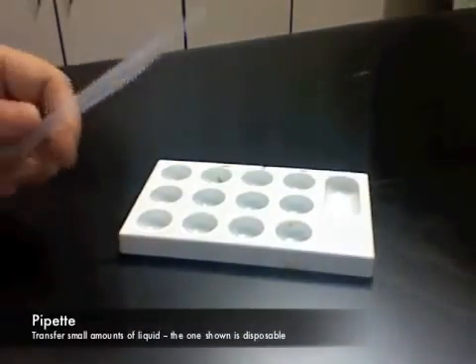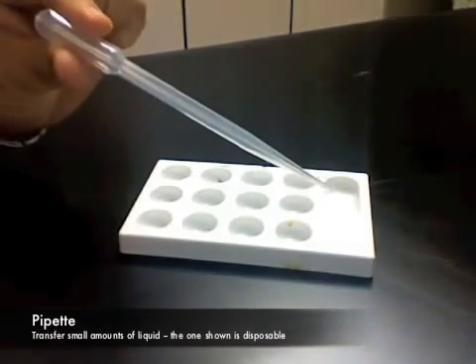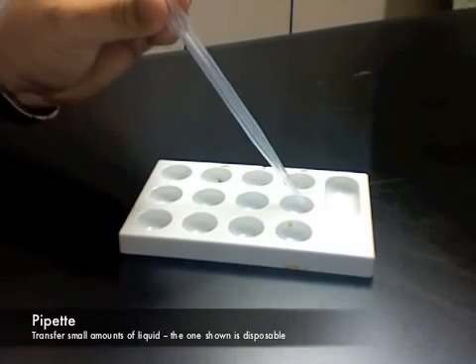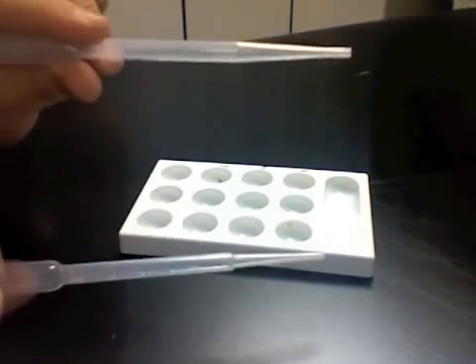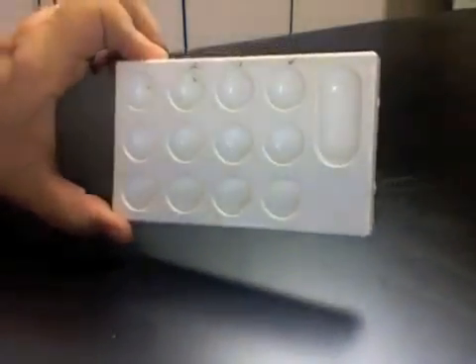And you would probably use something like this, a little disposable pipette. It has a little squeeze bulb so that you can draw the liquid up, and then you'd put a few drops in that one, and then you would get another pipette with a different chemical and put it in there in the same well and see if there's a reaction. So we have pipettes, and we also have a spot plate.